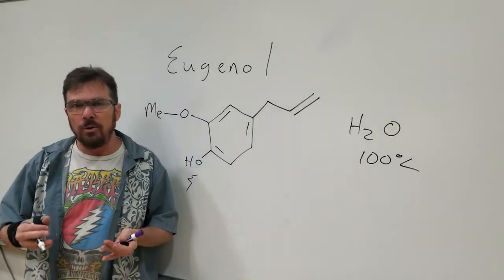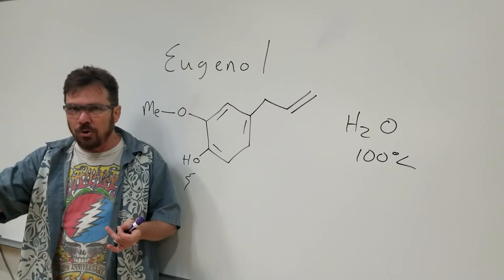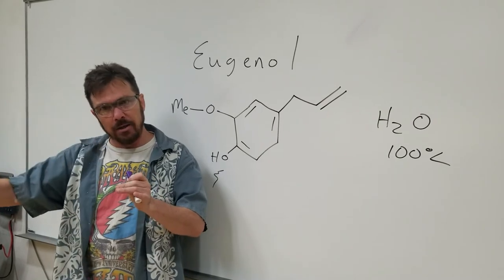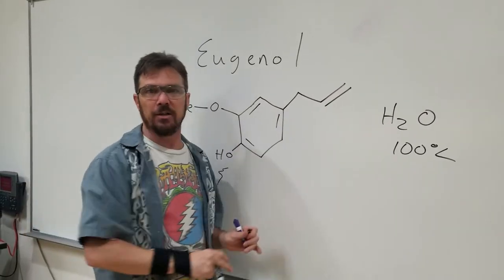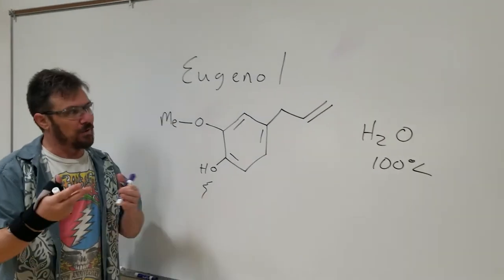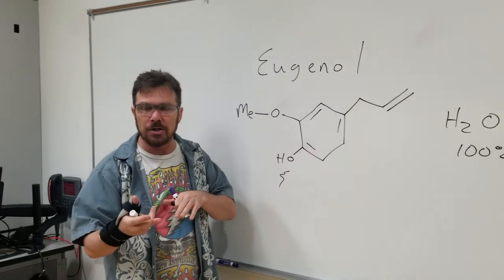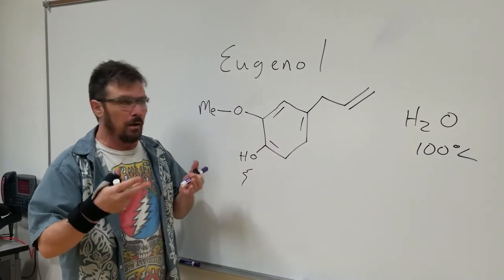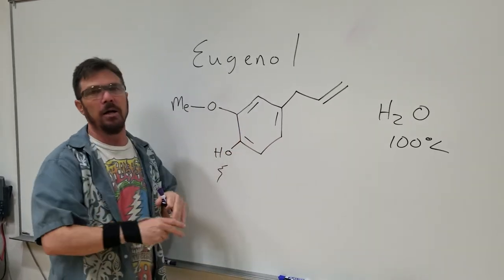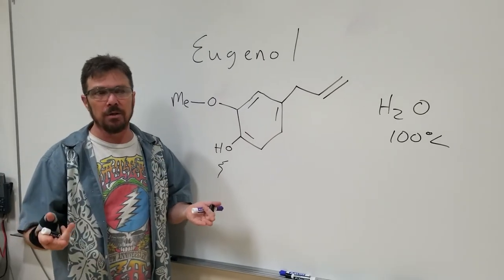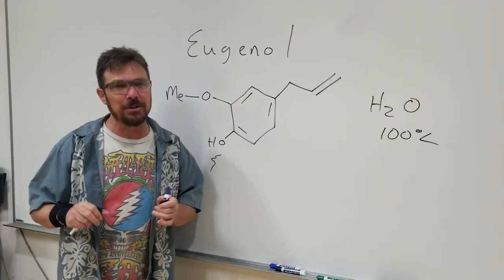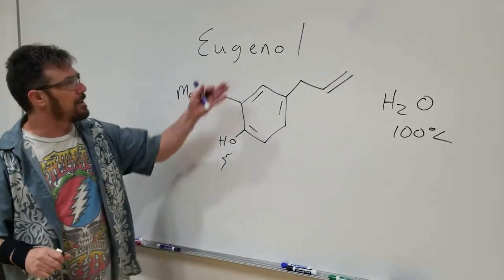We don't really want a lot of theoretical plates, so we're going to go with the short path distillation — as short as possible. If you look at the apparatus today, it goes right up into the condenser so we can get these to co-distill together. Once they're co-distilled over, we have a water-oil mixture, and we're going to use extraction with polar water and a non-polar solvent to extract out this compound from the water. Then we remove the solvent, dry it, weigh it, and calculate our yield — which is going to be very small. But this is essential oil; we don't need a whole lot.